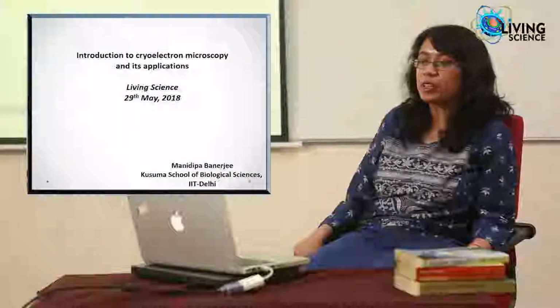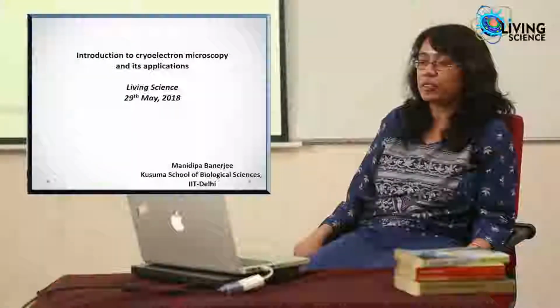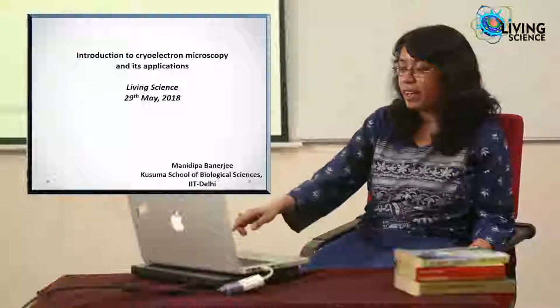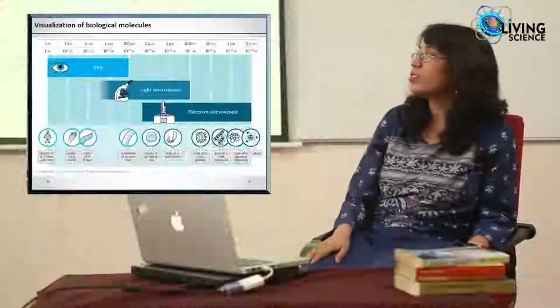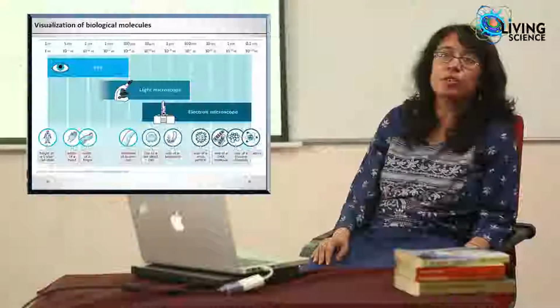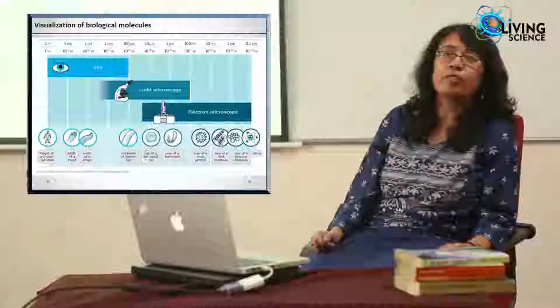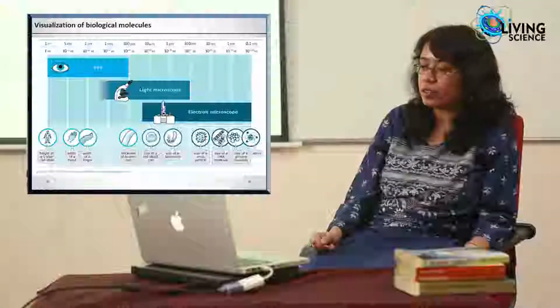So I'll be talking about an introduction to cryo-electron microscopy, which is a technique which has become very popular in the last few years, and its potential applications. And as the name suggests, when we say microscopy, we are talking about visualizing magnified images of small material.